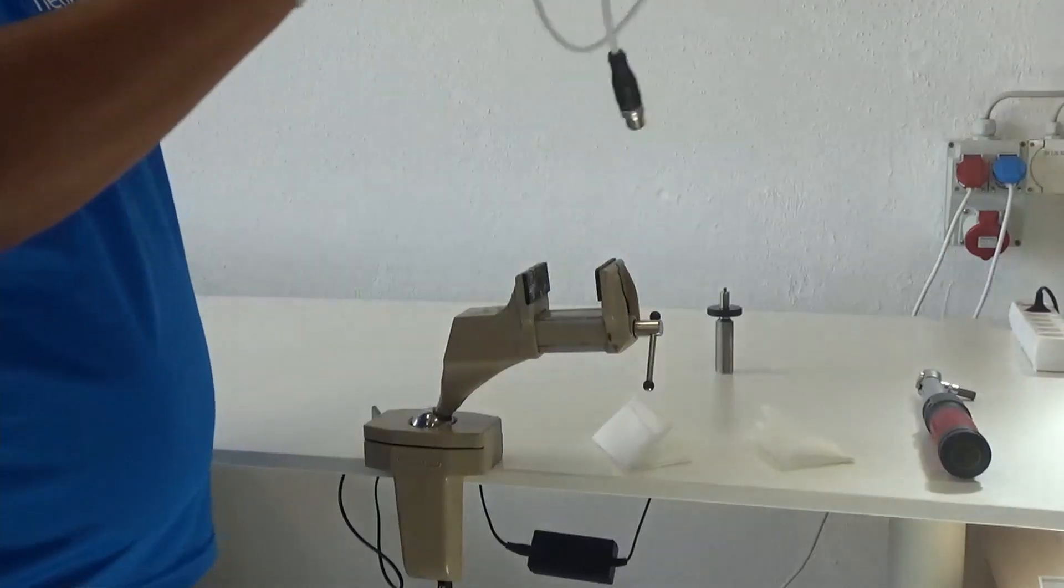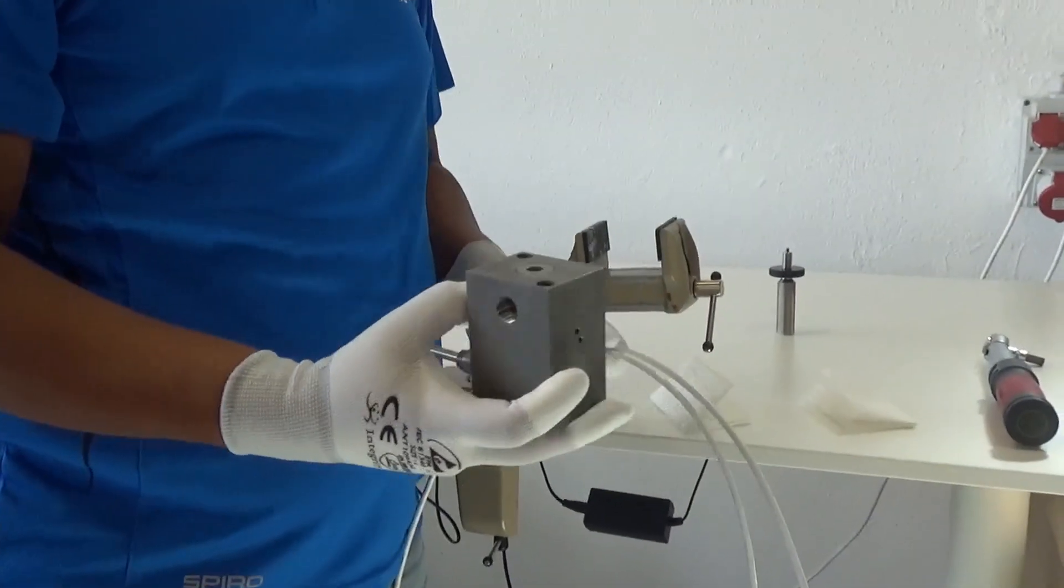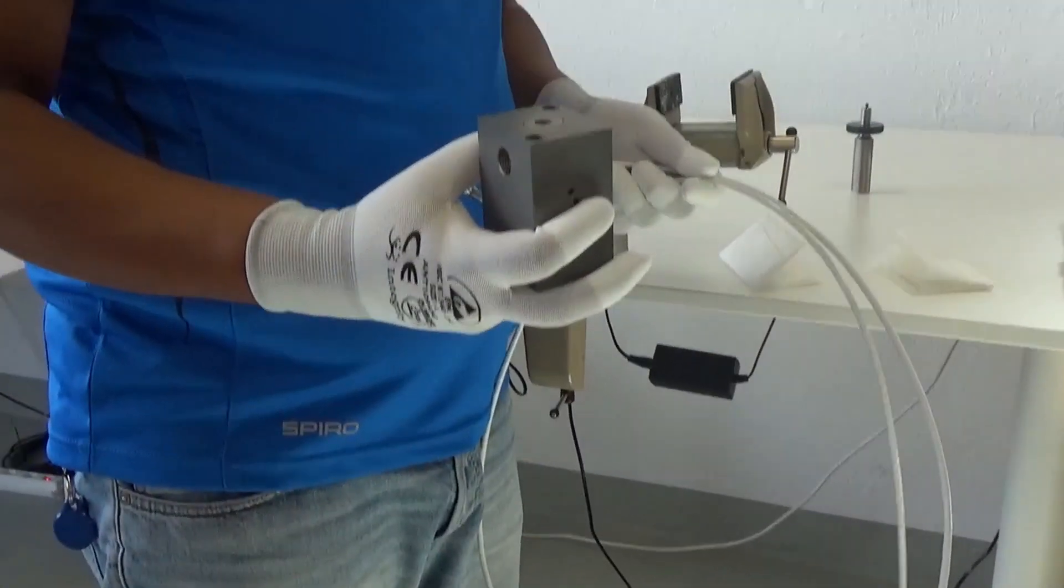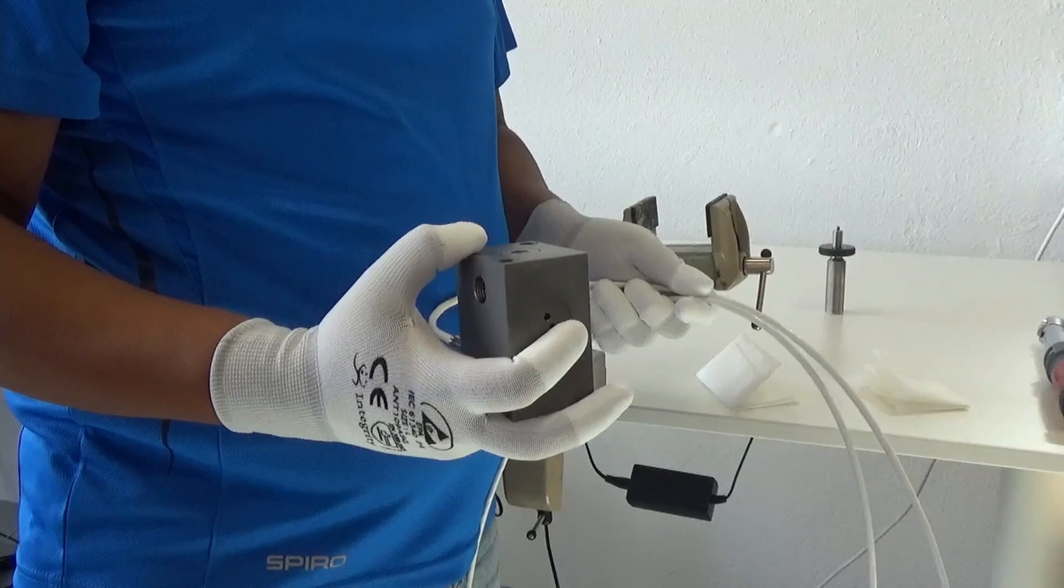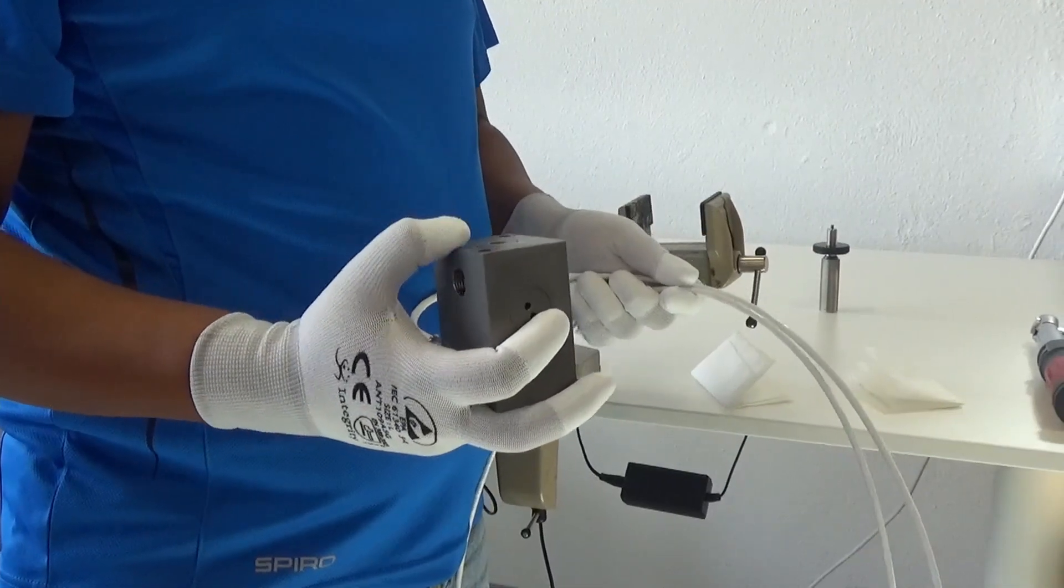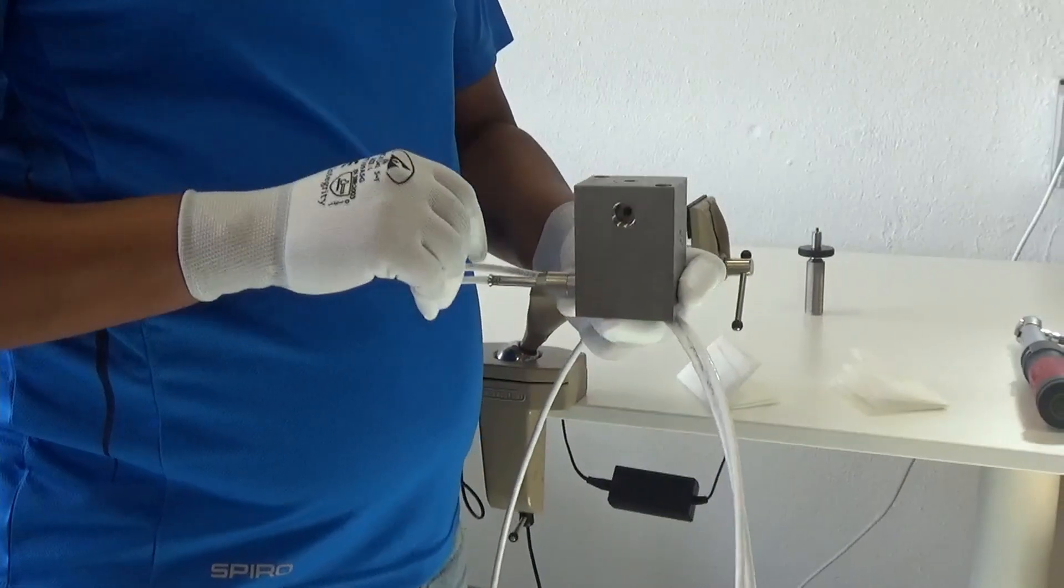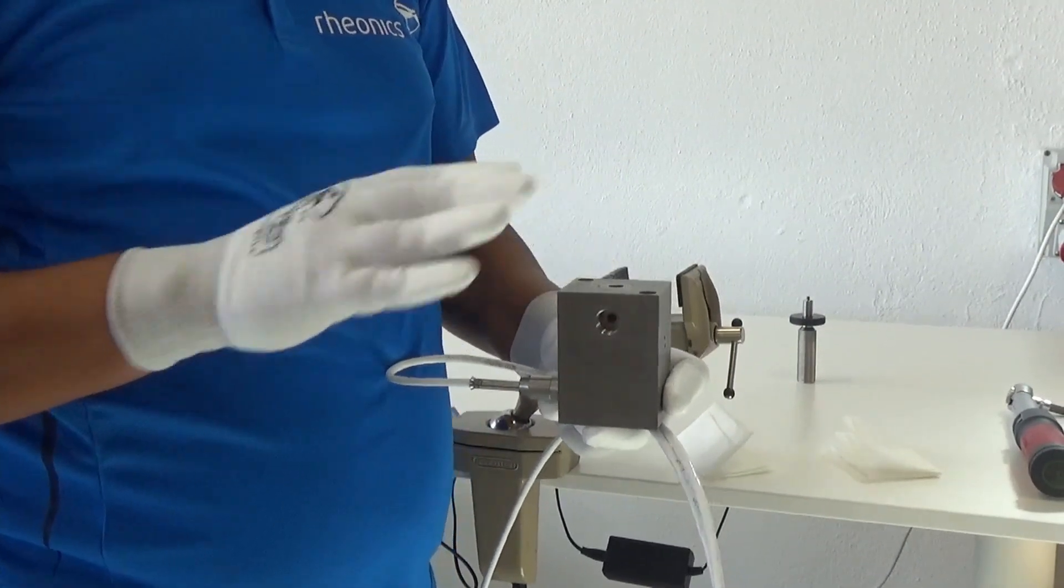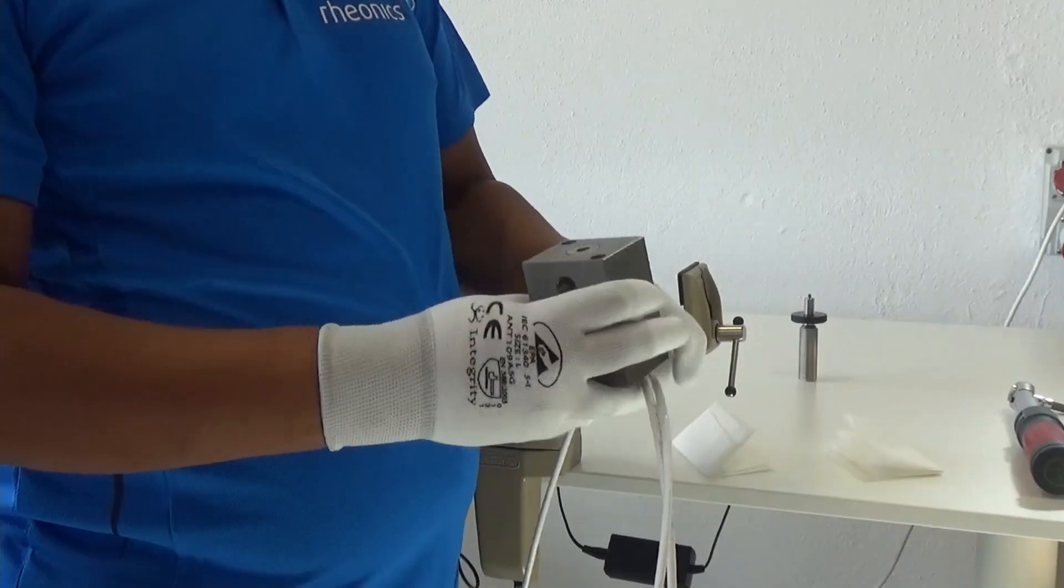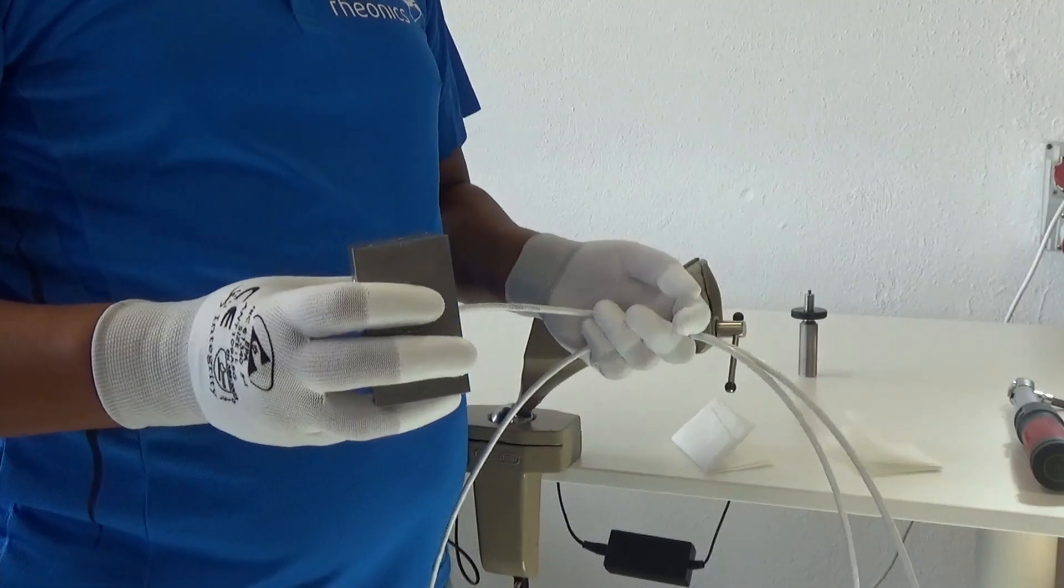Today we are going to talk about the Rheonics DVM, the high pressure, high temperature density and viscosity sensor. This monitors density, viscosity and temperature of your sample at the same time. Pressure wise it's rated up to 2000 bar which is 30,000 psi and temperature wise it's rated up 200 degrees centigrade which is about 450 degrees Fahrenheit.